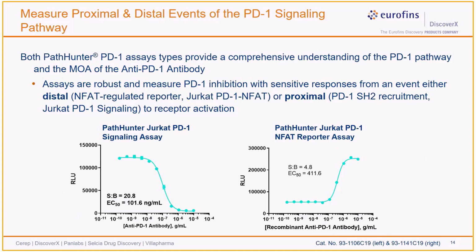In contrast, higher PD-1 antibody concentrations in the reporter assay format blocks PD-1 attenuation of T cell activation by the TCR activator, and a gain of signal is observed due to greater T cell activation occurring with the release of PD-1 inhibition of T cell activation.